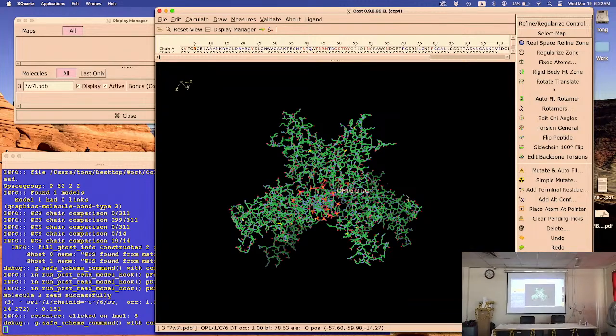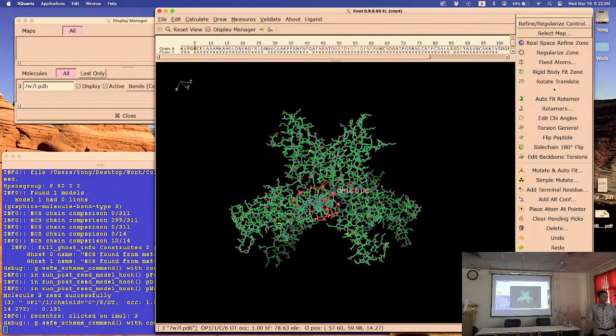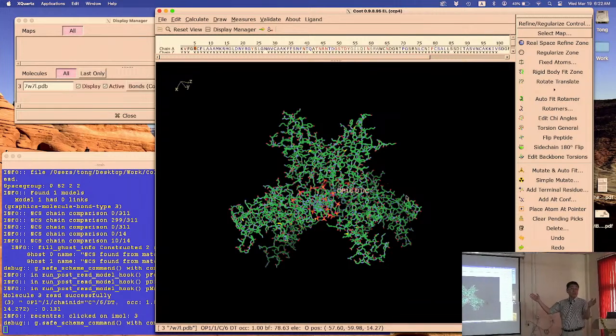That file is not showing in its window. So it's in the same folder as the lysozyme files. Okay? Everybody found it? Shaking head means yes, okay. Okay, are we good?